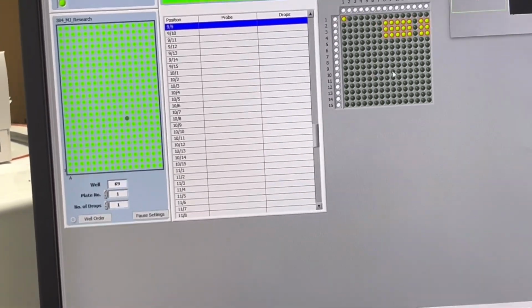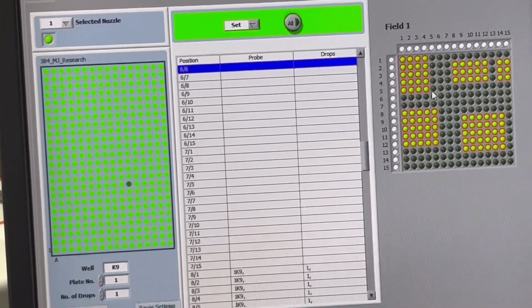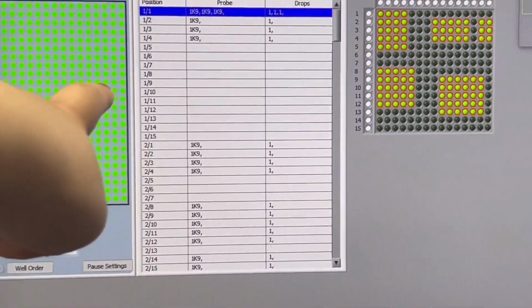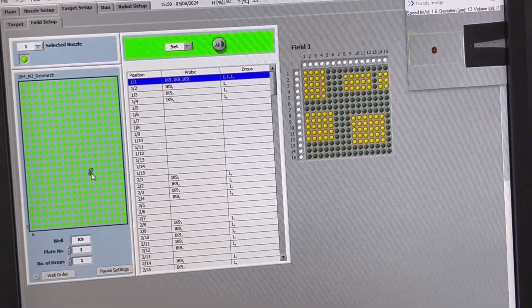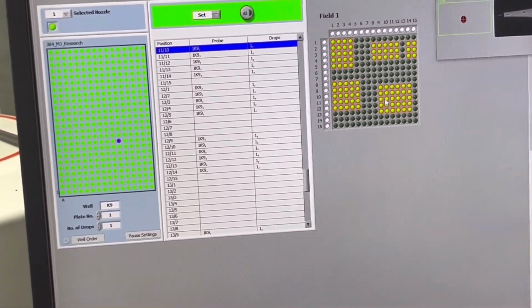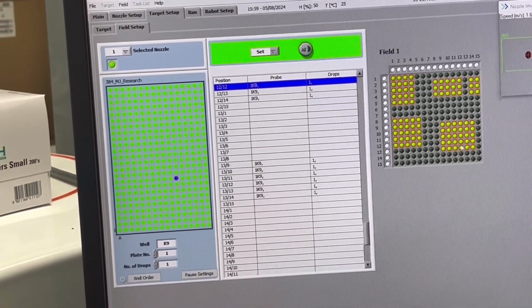like this. We can select the area we want to dispense. So this is the position, and this one, they will take up the solution first. Yeah, like the nozzle will move through this one, take up the solution and then print. And you can see they increase the number of spots, number of drops.